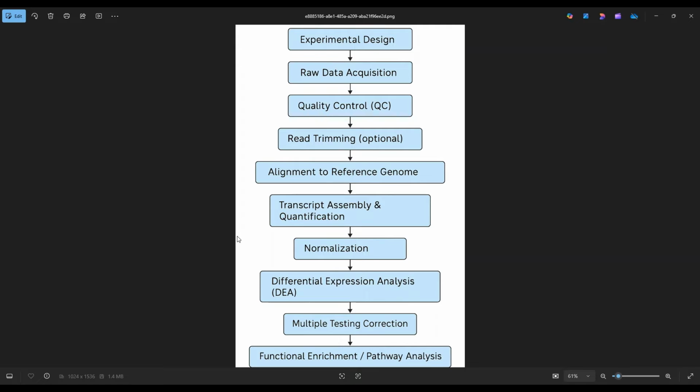And so these files are basically stored in different platforms or browsers like NCBI. In NCBI, you can find the SRA archive, and in SRA you can download the sequencing files. And the same if you go to ArrayExpress or Ensembl, you can download it from ENA. You can search it in ENA and see how you can access the raw sequencing files.